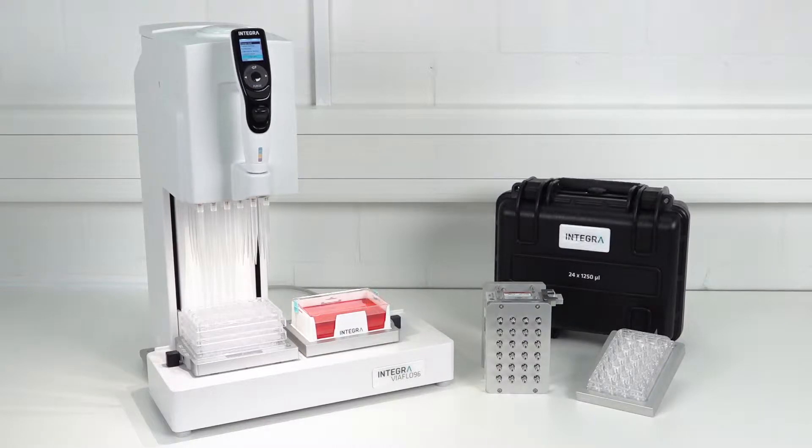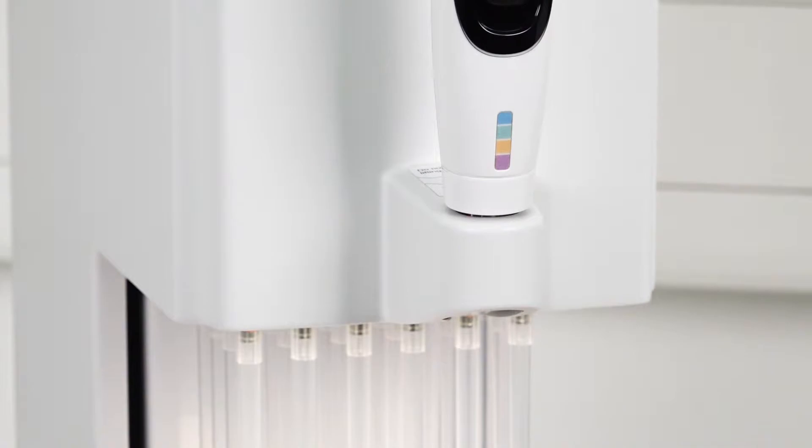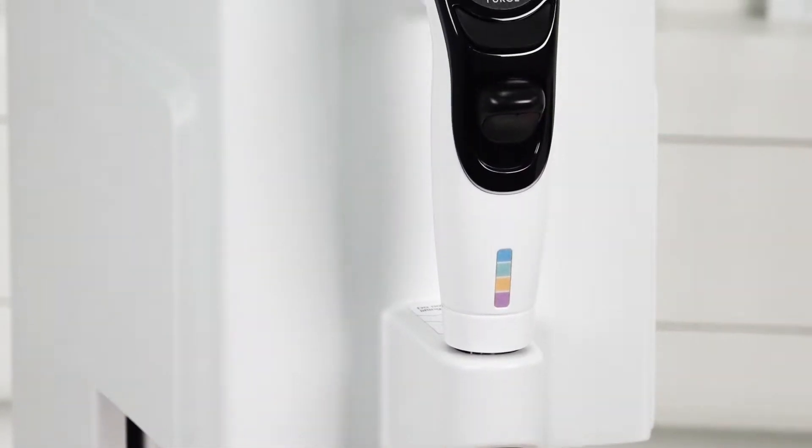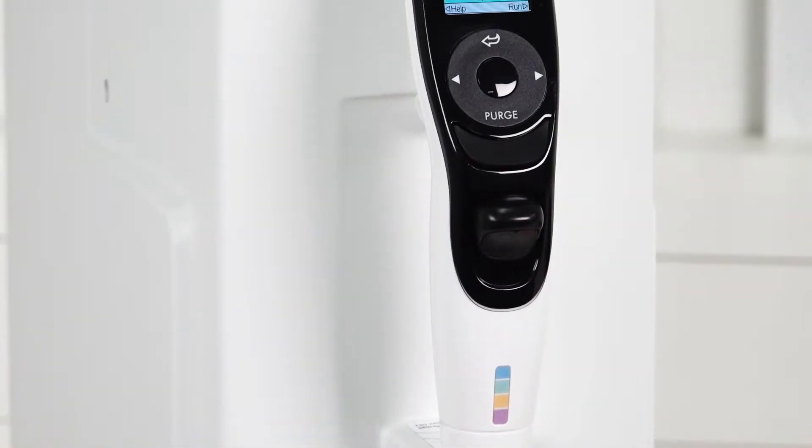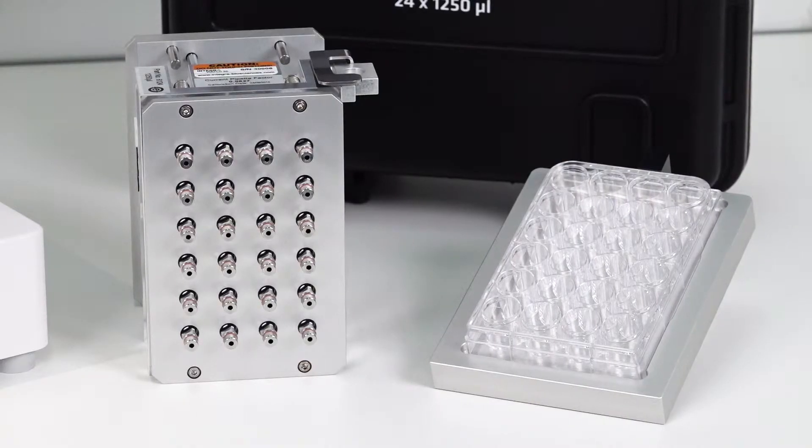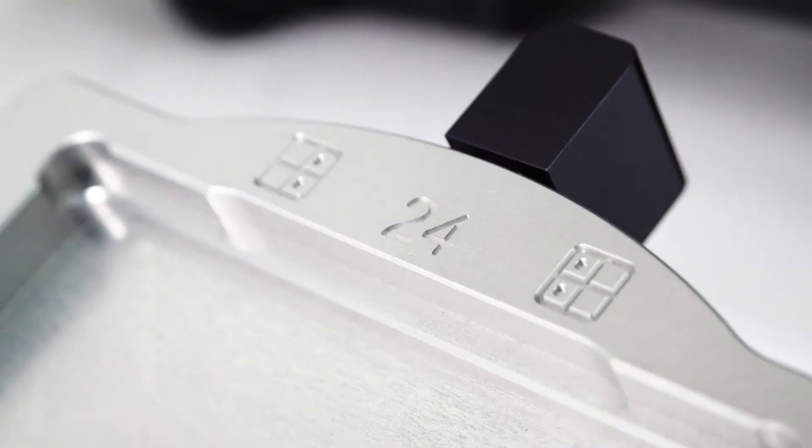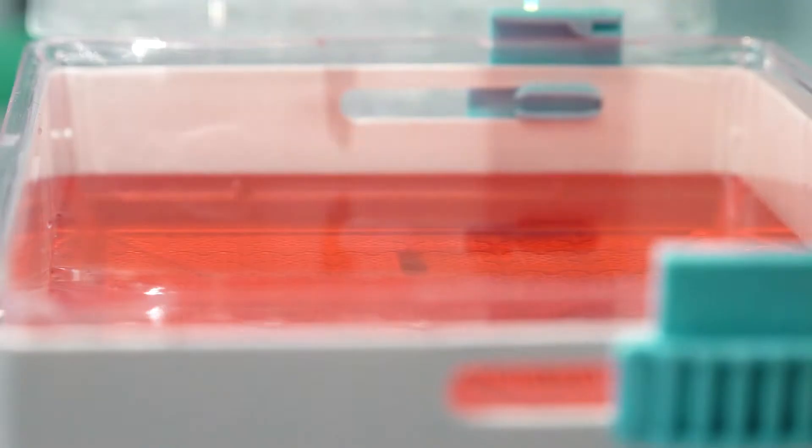Integra's 24-channel pipetting head further expands the pipetting possibilities of the ViaFlow 96 and 384, for example in Cell Culture Labs. With this pipetting head, filling 24-well plates is done quickly, easily, and efficiently.